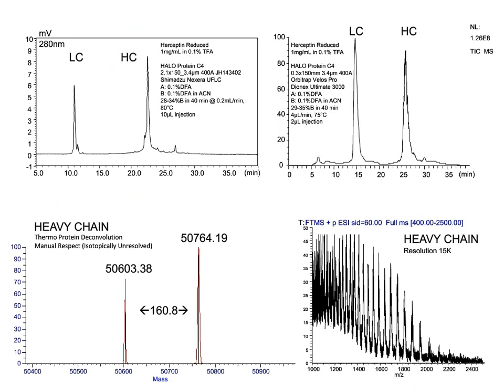Because we're now looking at a mobile phase modifier in difluoroacetic acid that is more compatible with mass spectrometry, we can couple that separation condition, in this case with the Orbitrap, and start to deconvolute the mass spectral data in order to obtain some information on the modifications, in this case glycan modifications, that we can pull out of the heavy chain mass spectral data.